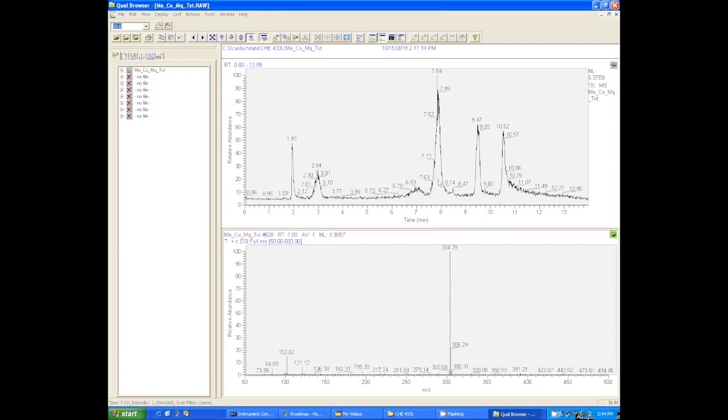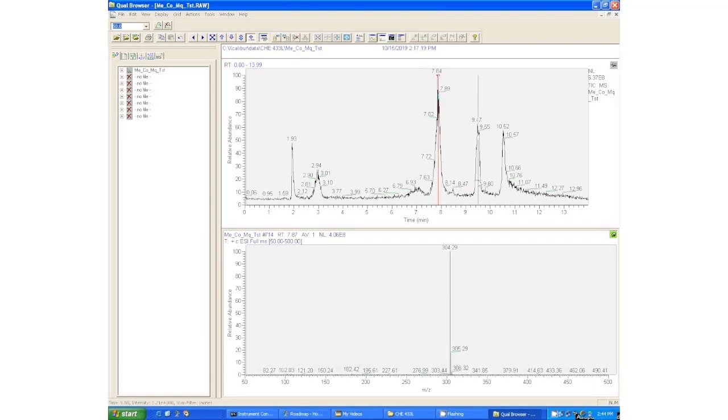So let's look at some peaks. If we click on this guy right here, this is 304, and that corresponds to the expected mass for cocaine. Now we can't say for sure that this is cocaine just based on that. I know that there's cocaine in this, but we can say that that mass is consistent with the mass of cocaine.